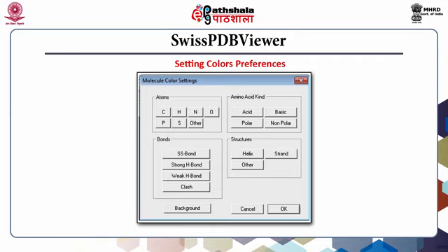The scheme is named after the CPK molecular models designed by chemists Robert Corey, Linus Pauling, and improved by Walter Koltun. In the original scheme, carbon was shown as black, but in the present example we will use white because we are using the background in the present example as black.